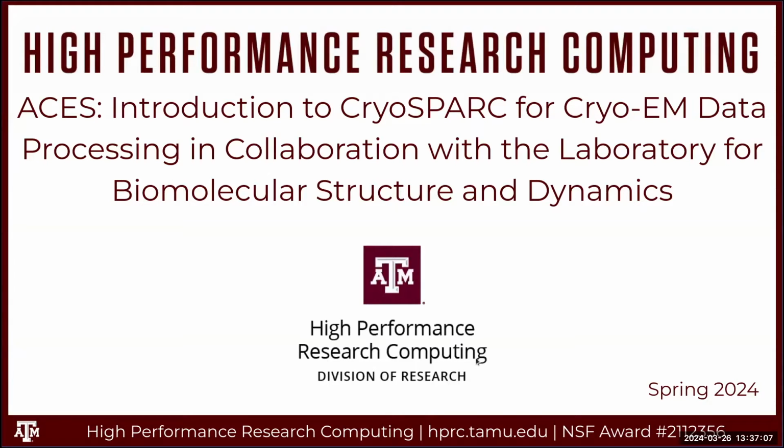My name is Michael Dickens. I'm a research scientist with High Performance Research Computing. Today, we're going to have two parts to this short course. In the first part, I'll show you how to access CryoSPARC on the ACES cluster. And then in the second part, we'll have another speaker who will go over the hands-on tutorial.